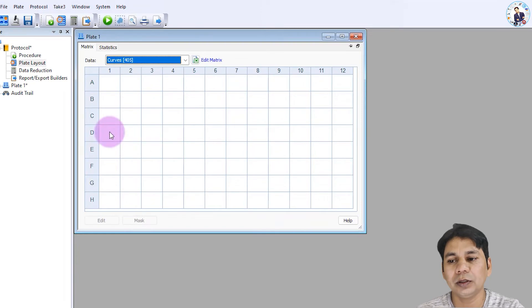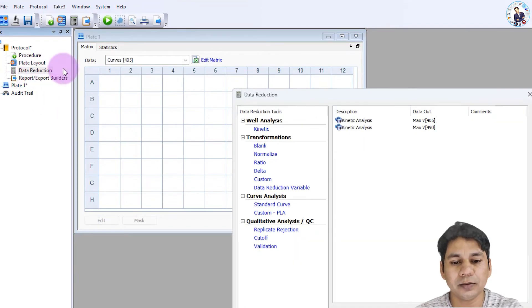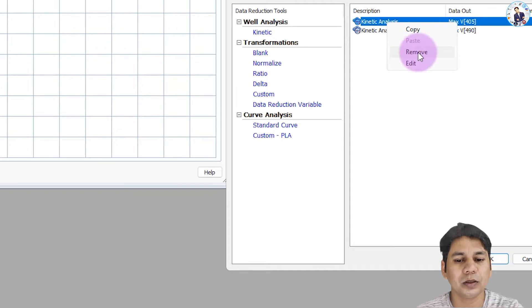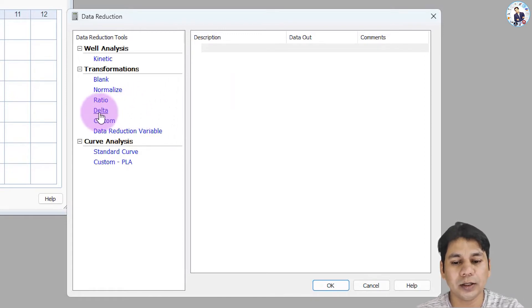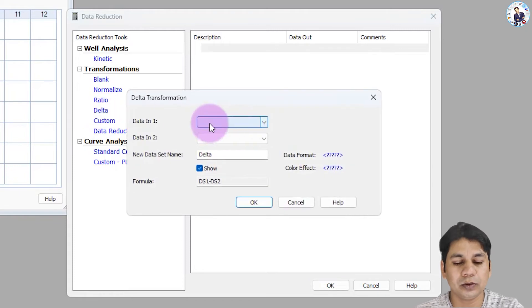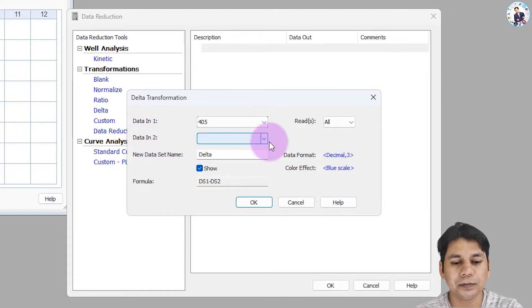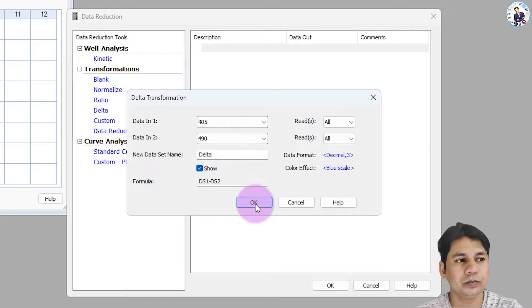The next step is data reduction. By default, it has kinetic analysis loaded, so I am going to remove that. First, we have to perform the delta reduction option to remove the background absorbance of the plate. I am selecting delta here — data at 405 nm minus data at the reference wavelength 490 nm. You can see the formula and the name 'delta.' Click OK.